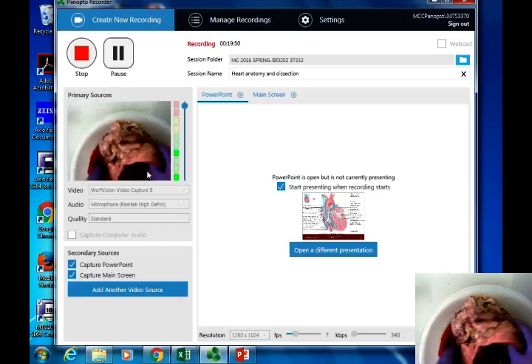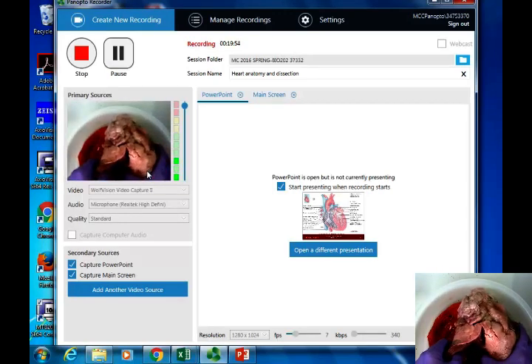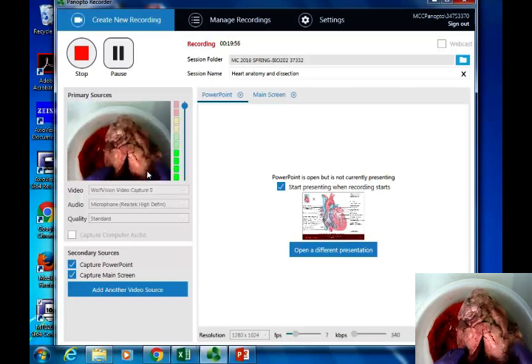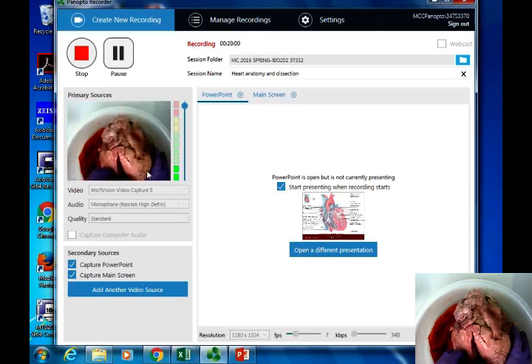So it's got to be able to expand. This is that right ventricle. So it's got to be able to open up and then fully collapse in order to eject that blood. So you've got to have that flexibility to it. When you see a heart beating, it's actually all these different chambers filling and then collapsing again and again. The moderator band on it.